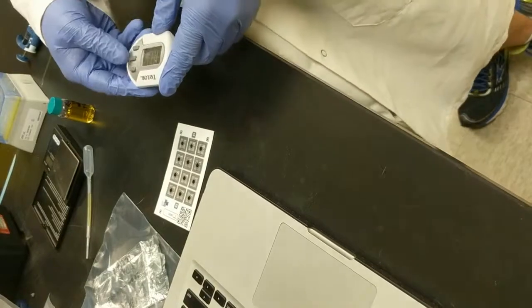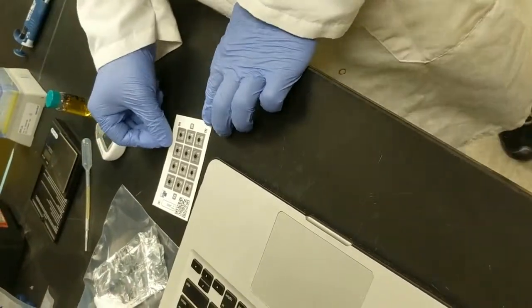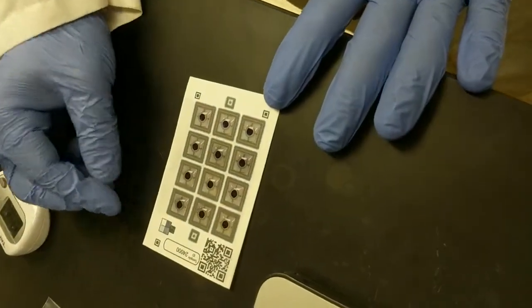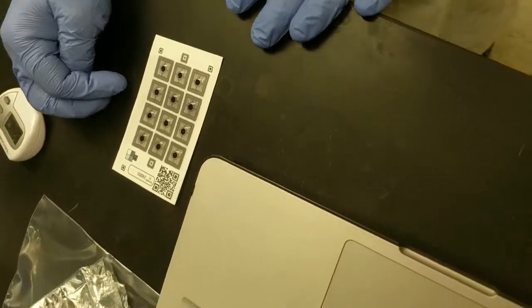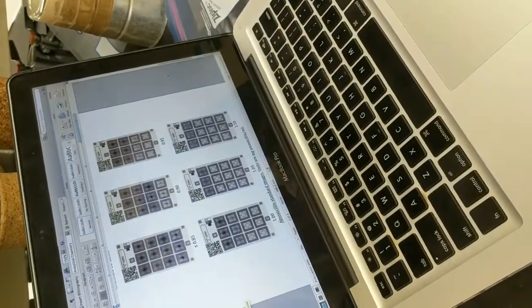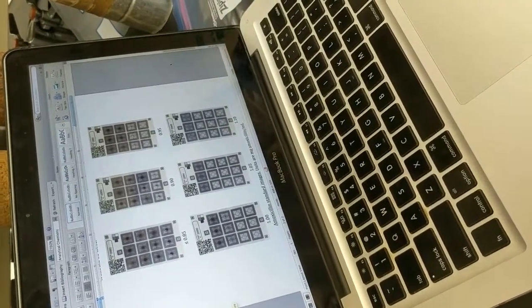Alright, the 3 minutes is up. At this point in time, if you have a cell phone camera available, you'll want to take a picture of the test card to track the result in time. Then, you can compare how the test card looks to a set of standard images, shown here. Here, you pick the one that looks the most similar.